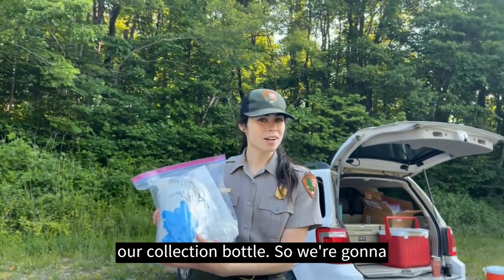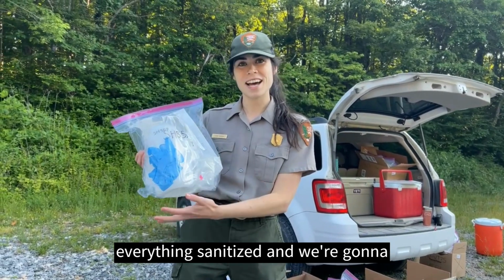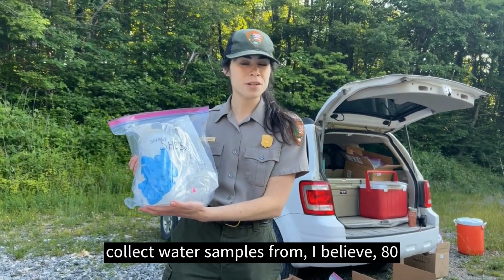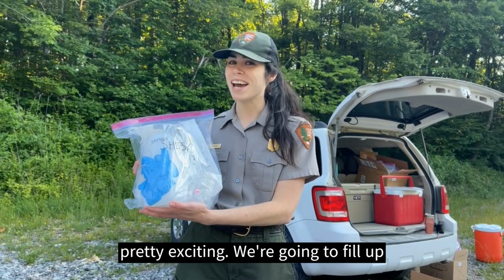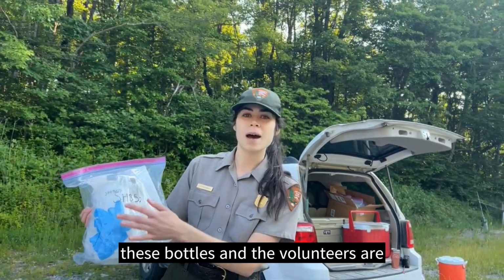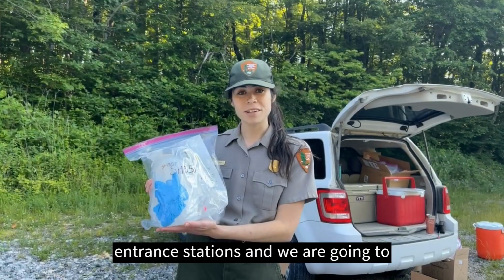And this bottle is our collection bottle. So we're going to have our volunteers put on gloves to keep everything sanitized. And we're going to collect water samples from, I believe, 80-something sites in the park today. So pretty exciting. We're going to fill up these bottles, and the volunteers are going to meet us back here at the entrance stations. And we are going to filter those.